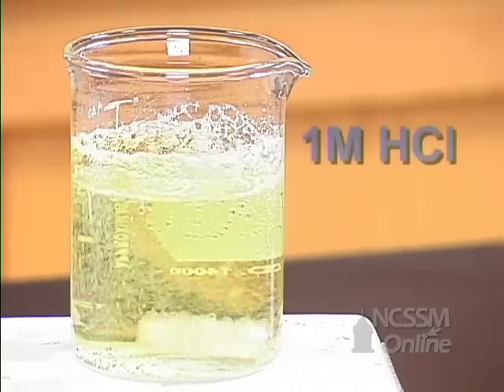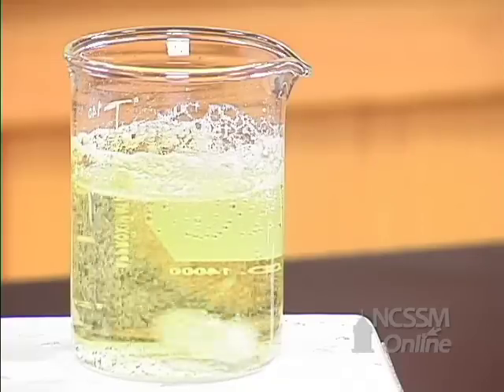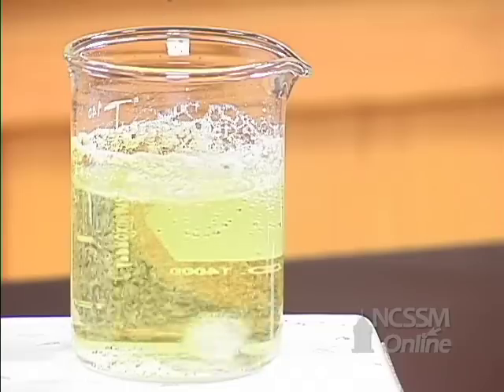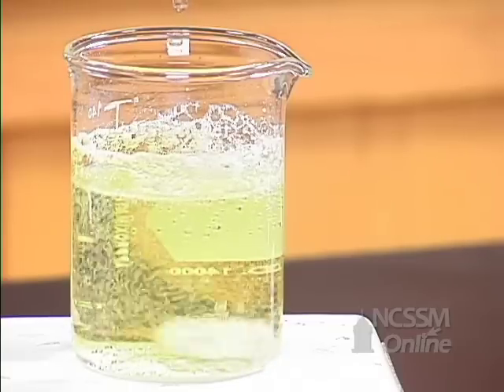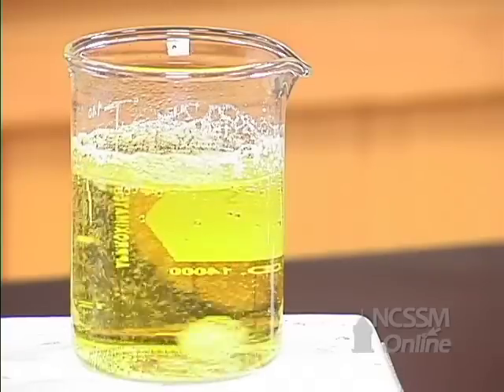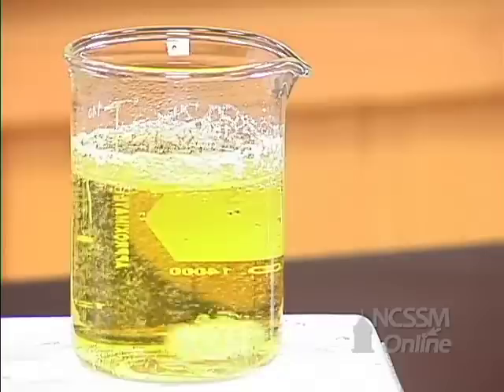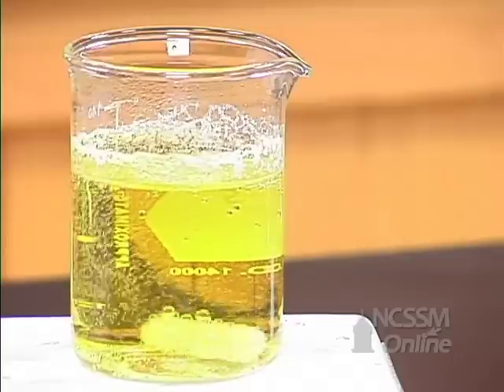We'll add one molar HCl. After adding 60 drops, the solution turns yellow. The buffer has maintained a relatively constant pH for a long time.